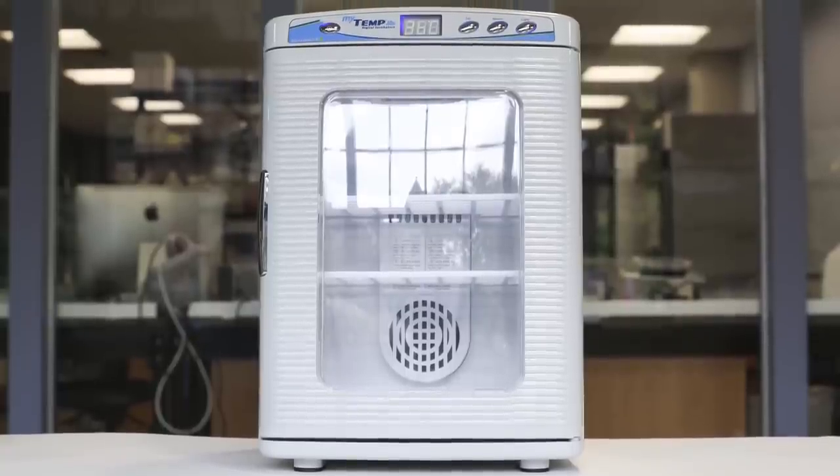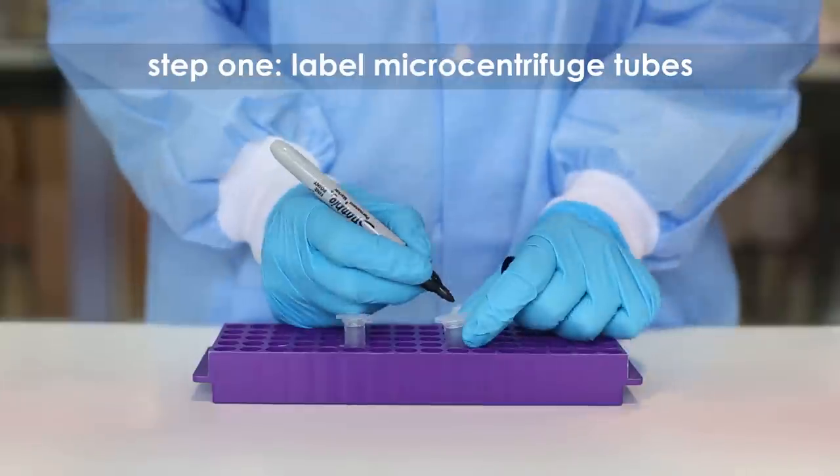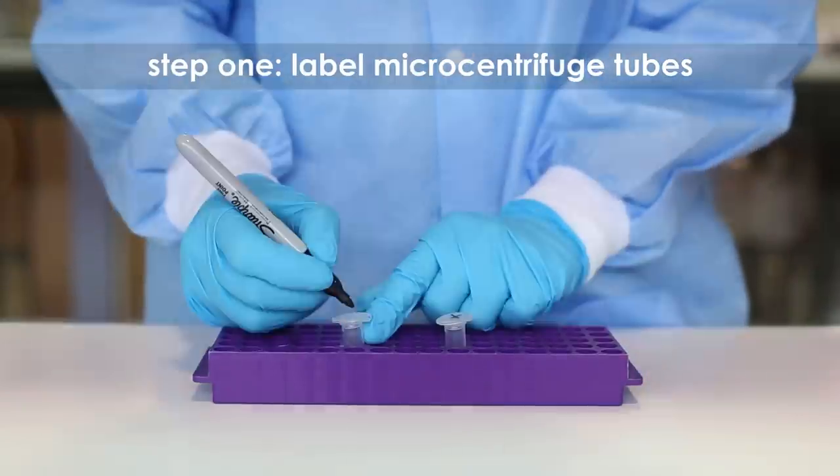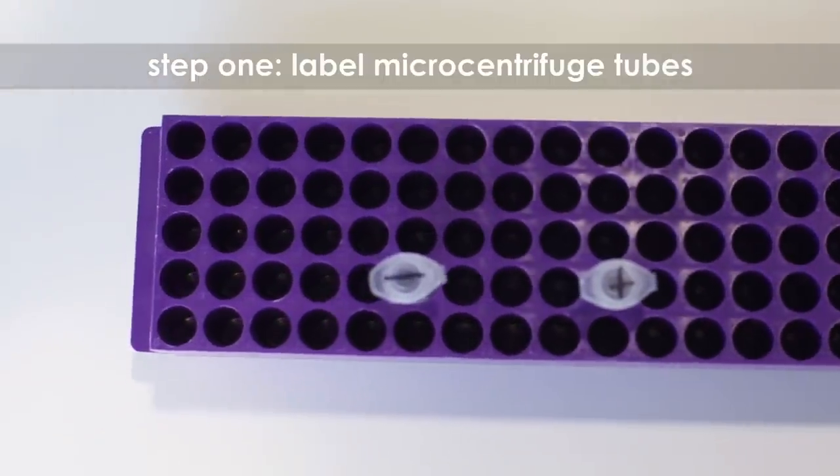Step one: label one microcentrifuge tube plus DNA and a second microcentrifuge tube minus DNA.